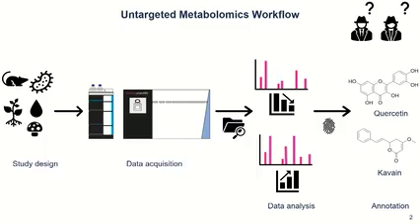And I guess all of you know the issue that so far public databases are very small compared to the number of compounds we know, or we don't even know. So this is something we want to tackle with our workflow, to have a pipeline that we can use to quickly get the spectra out, have a data file that you can use in your library or in your lab, but we also want to make them publicly available so that you're open to share the data if possible.